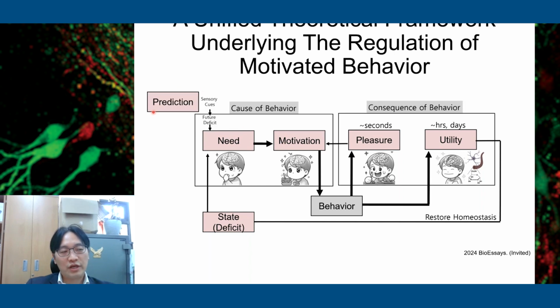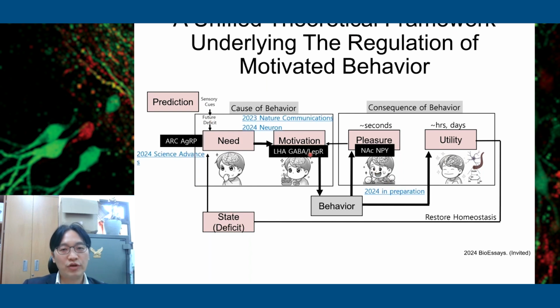And always the brain has this sensory cue driven prediction based on this. So I suggest you have some kind of framework of all the components of your interest. In our lab, we have been trying to investigate each component by studying them, and Miniscope has been one of our main tools to investigate the neuronal component responsible for these psychological components.